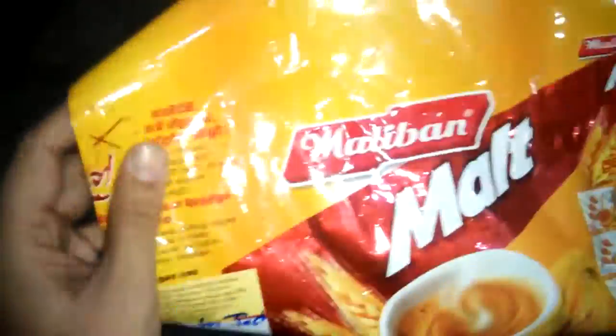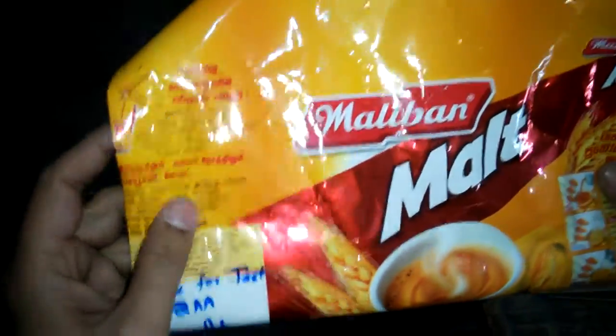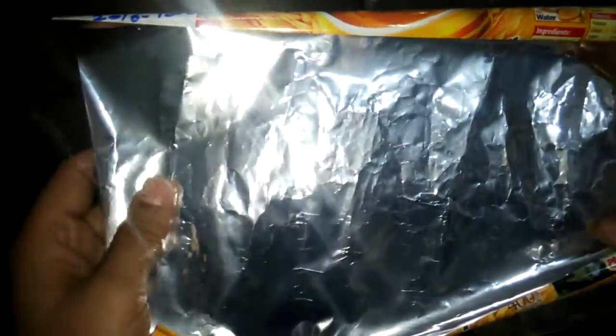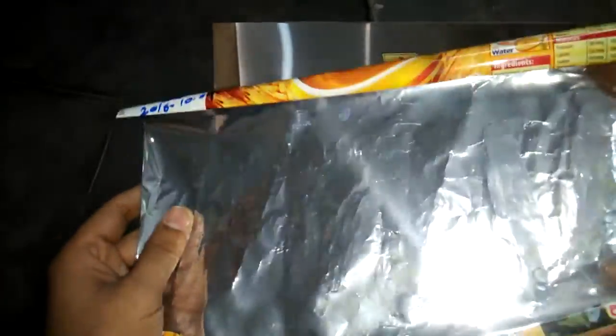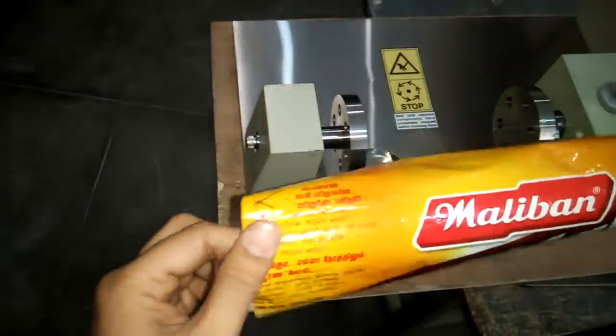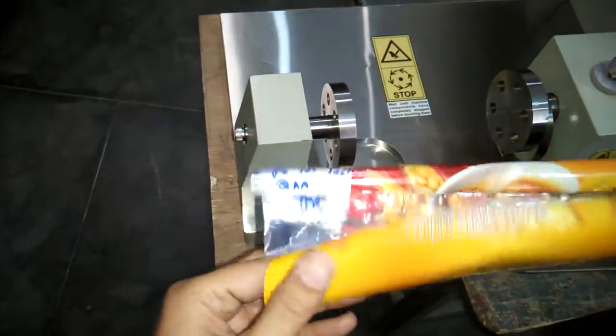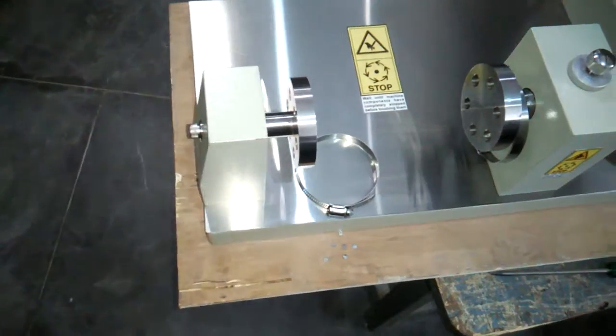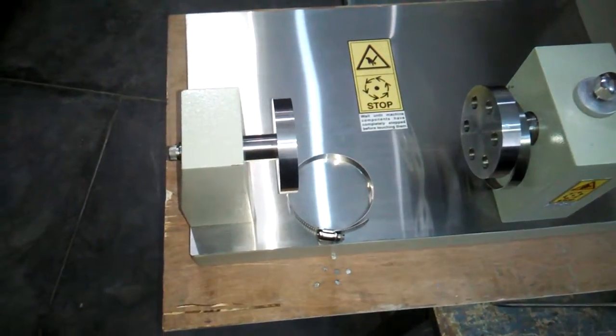So this is the condition of the Maliban malt, and this is the condition at the back side, the silver side. Similarly, if we had the WVTR equipment, we could test the permeability of the water vapor as well as the oxygen.